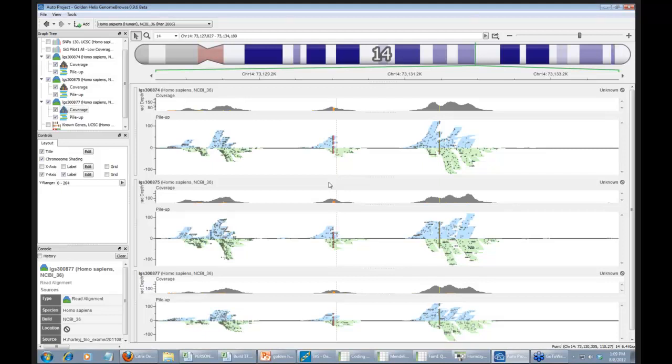One thing we quickly noticed is that almost all of the SNPs where the child was called heterozygous, and when we came back and sequenced them they were actually homozygous, had a very low alternate allele depth. In fact, of all the de novo SNPs we've validated by Sanger sequencing, we've never found one that had an alternate allele depth below 18.